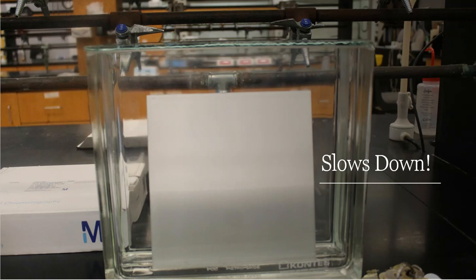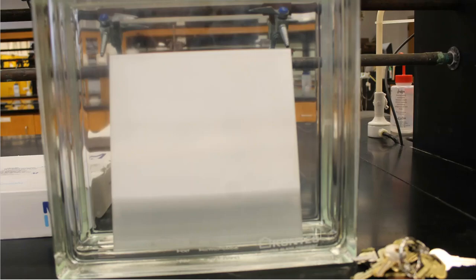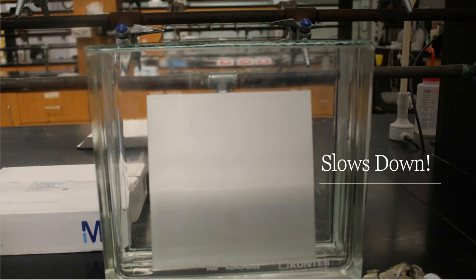The reason I'm doing this is I'm showing you that it does slow down over time. The higher the liquid level goes, the slower it's going to move. The capillary action is actually affected more and more. So if I go back and quickly do a comparison, this is the initial. 3 minutes later, it goes here. 10 minutes later, it doesn't move up quite as much.